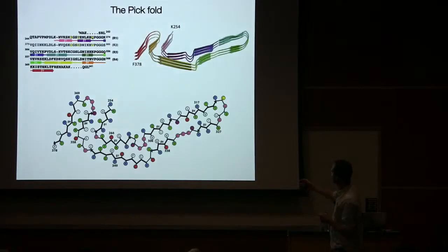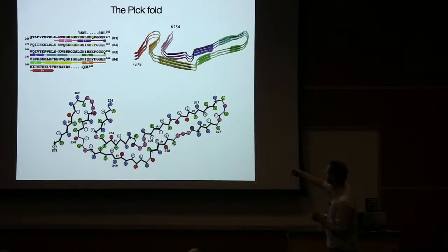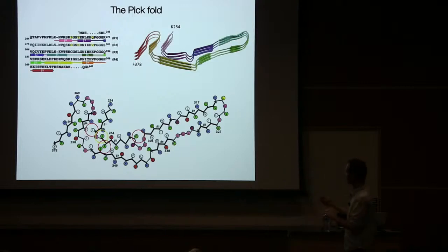If we look at the assignments, what is part of the ordered core starts here at lysine 254, which is part of R1. And remember, only 3 repeat tau isoforms are incorporated in the tau filament. So all the filaments then go straight from lysine 274 to valine 306. The numbering is a bit confusing here, perhaps, but that happens right here. Because part of repeat 1 is present in the ordered core, you can now compare the homology between R1 and R2. There are these 3 different residues, and if you tried to place a 4 repeat tau molecule in this filament, you would get clashes and things wouldn't work out. So again, the extent of the ordered core explains the biochemical composition of the filament. The 4 repeat tau molecules would just not be able to adopt this type of structure.